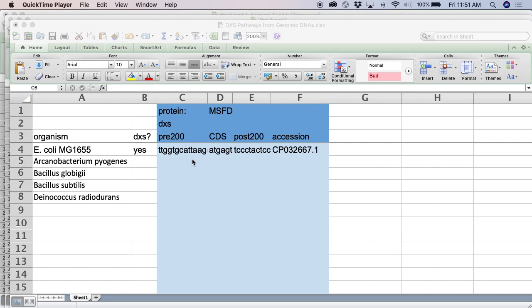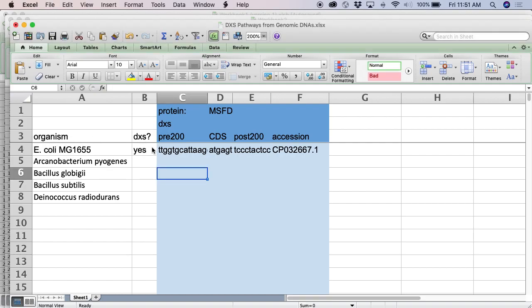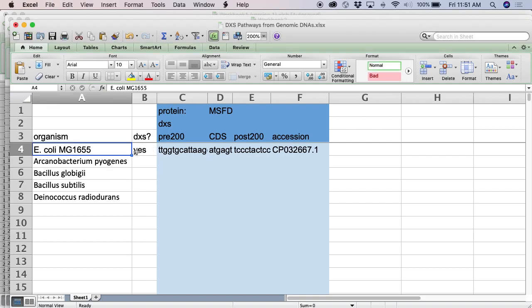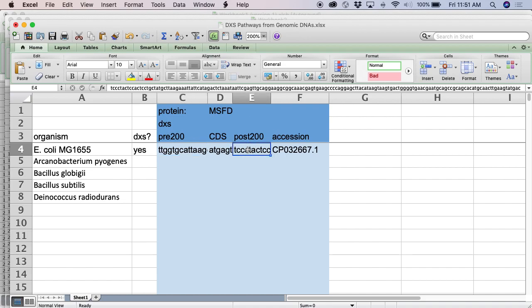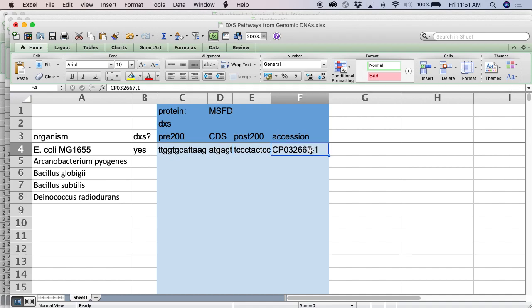Here I'm going to show you how to find the orthologs of a gene. In this scenario, we already have one gene that's in E. coli MG1655. We know about this one. This is its CDS sequence. This is the pre-sequence, which is just the 200 base pairs or so upstream of the CDS. That is its post-sequence, the 200 base pairs after the CDS. And this is the accession number from which I got the data.